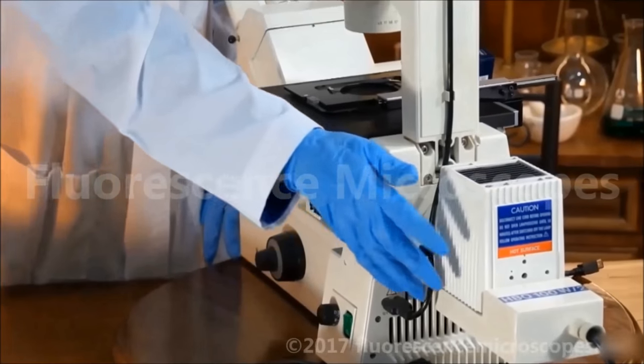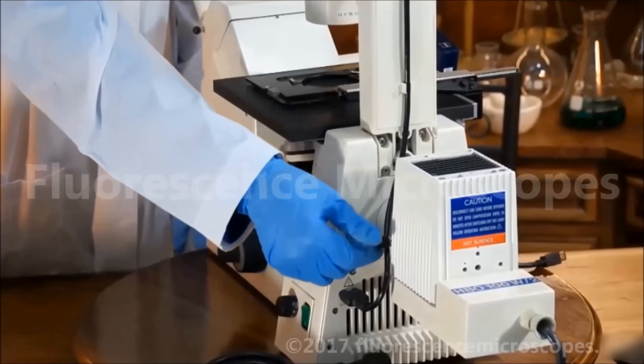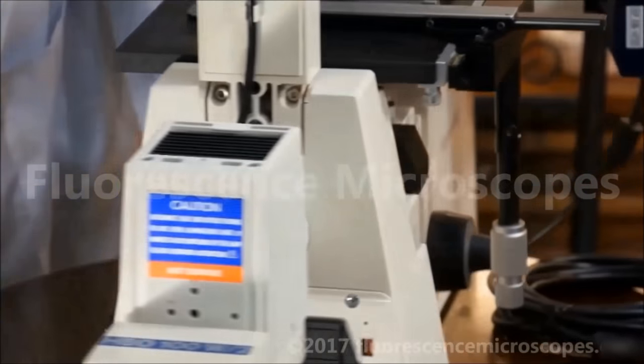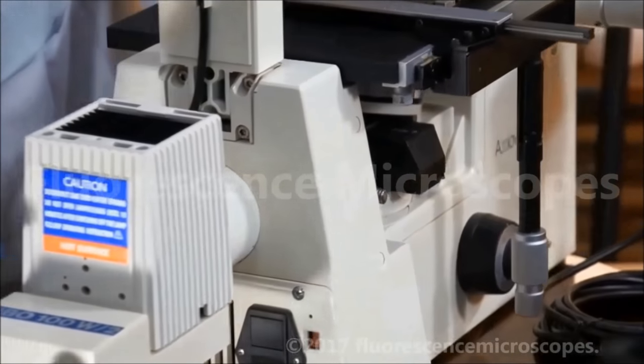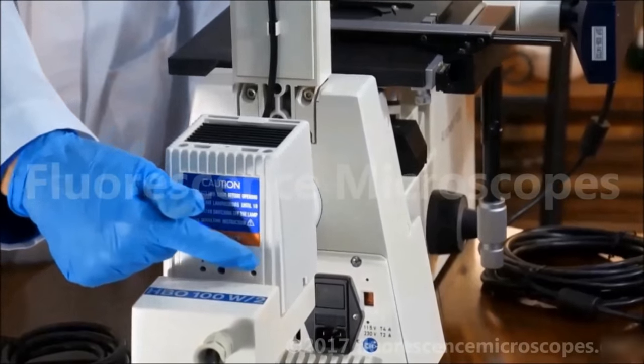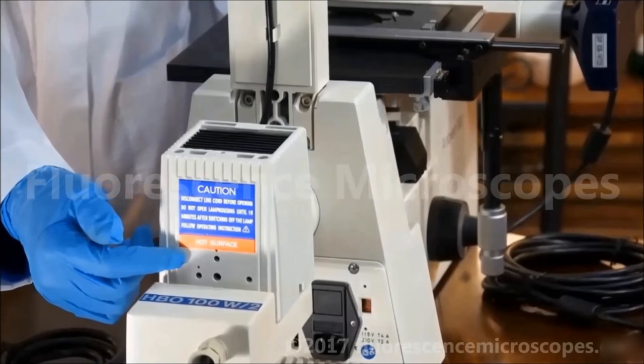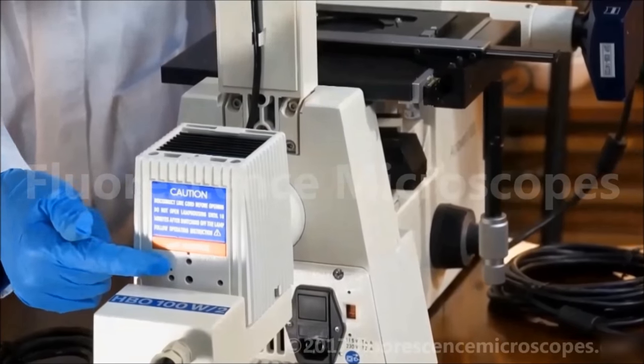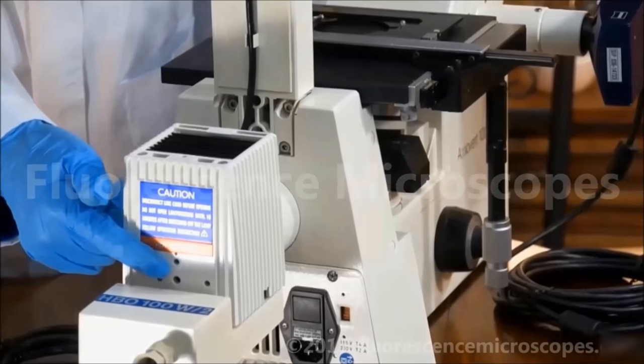There's some adjustment knobs to do the centering. This is for the collector focusing. On the back, you can see some openings where you can insert a 3-millimeter hex allen head wrench, and you can adjust the centering of the bulb.